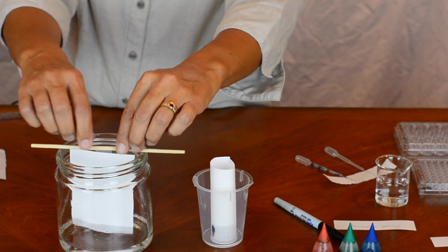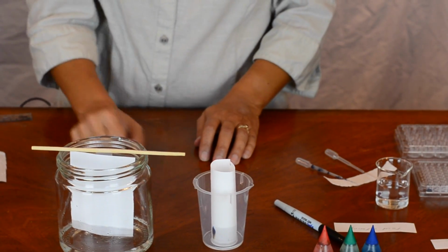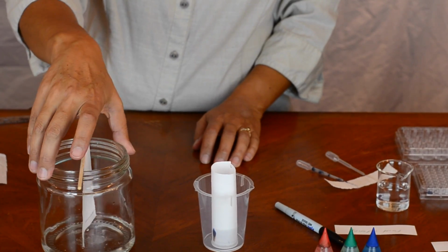Alright, so now that water is going to diffuse up this paper, and as it goes, the idea is that it's going to separate components of mixtures based on physical properties. In this case, we're hoping that there are things that have different molecular mass, molecular size, so that the heavier items are going to move more slowly than the smaller items, and that's how we're going to carry out their separation using the paper chromatograph. So we're going to give that about half an hour, the book tells us. We'll wait and see how long it takes.